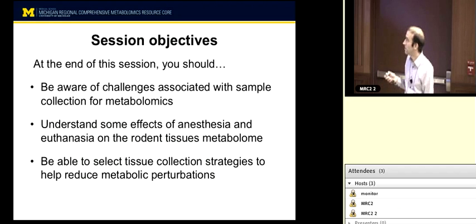We also did tissue collection under anesthesia. In other words, we established a surgical deep plane of anesthesia like you might do if you were going to do some sort of survival surgery, but then we collected tissues under these conditions. Of course, you're collecting major organs, so this was a terminal event, but blood circulation was ongoing to the point of collection of the tissue. This is a standard protocol that is sometimes used, but it's a lot less commonly done, and nothing had been really studied about whether this makes a difference at all in terms of metabolomics.